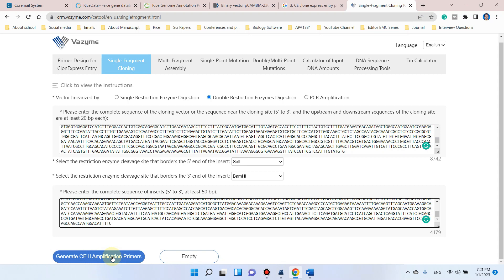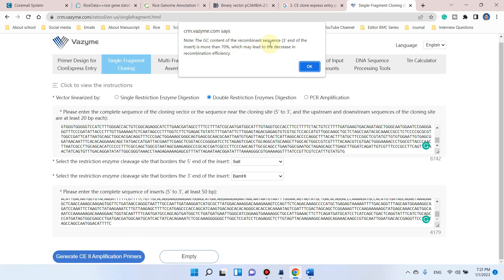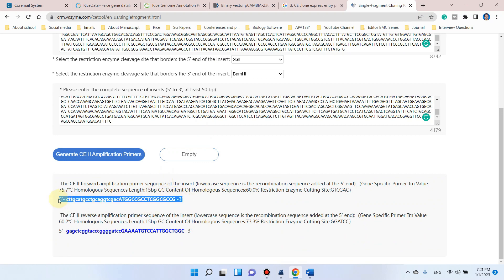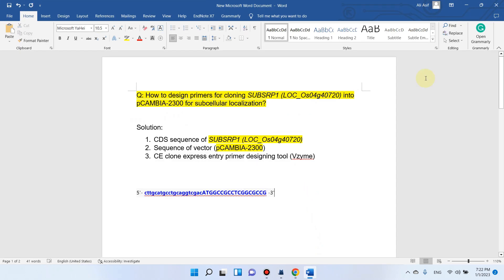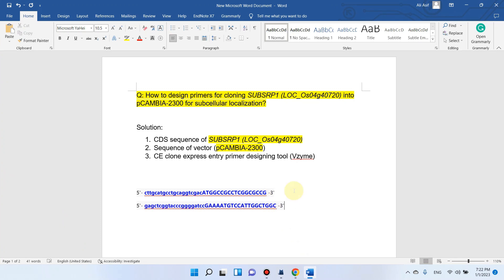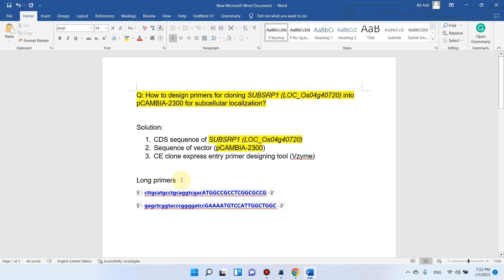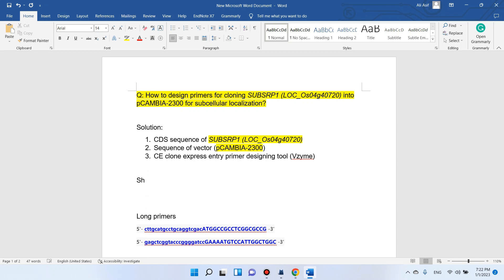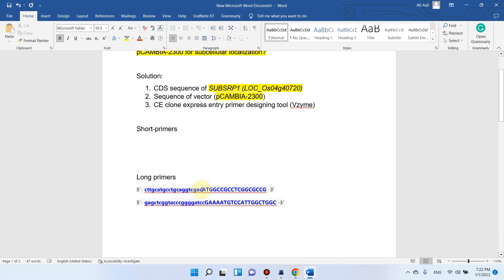Now we click 'Generate CE2 Amplification Primers.' It is showing a message that GC content of the recombinant sequence is more than 70 percent — that is okay. Here we have obtained two primers. We will copy these primers — this is the forward primer and this is the reverse primer. I will call them long primers. You can use these long primers directly for cloning, but if you face difficulty in amplification, you can first use short primers and clone your fragment separately. I recommend using short primers first if you are not getting amplification.